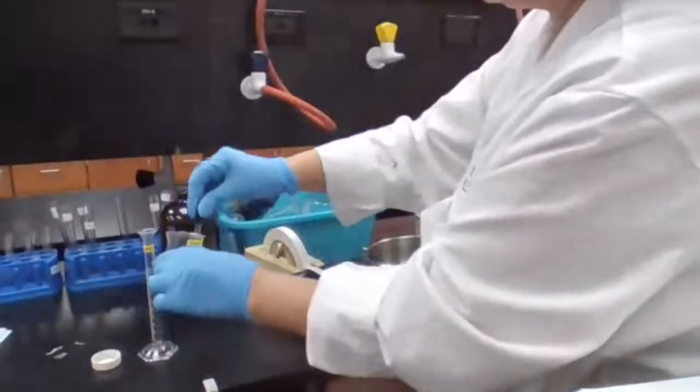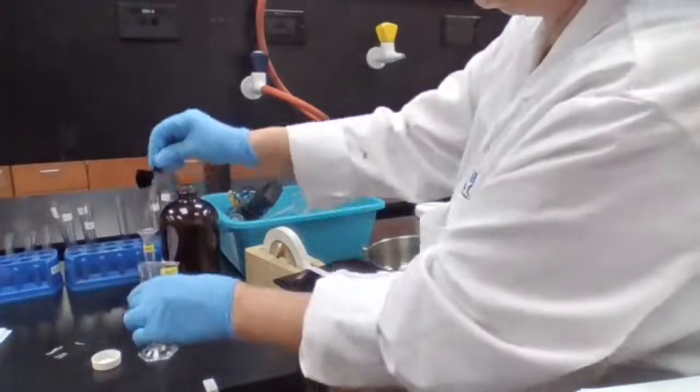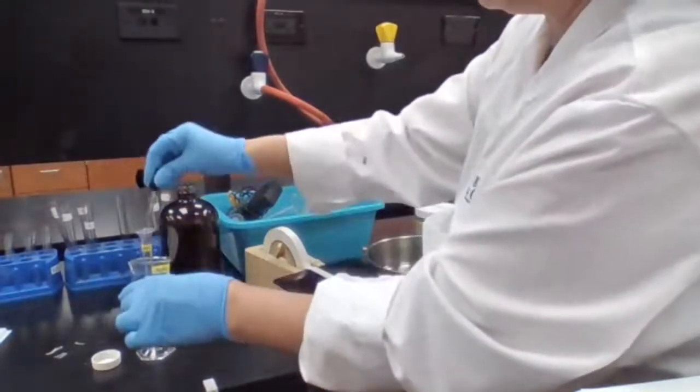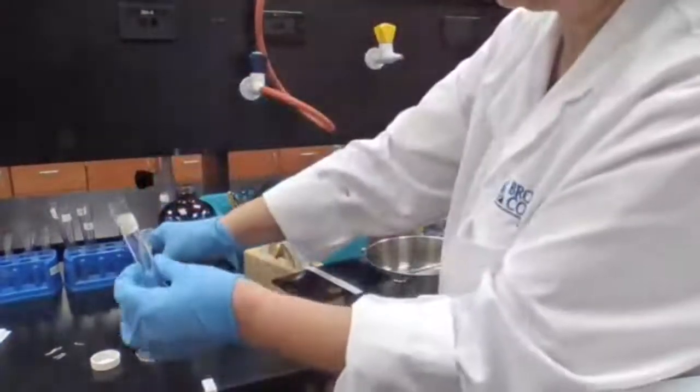Now this time we are going to take 2 milliliters of silver nitrate in a different test tube.